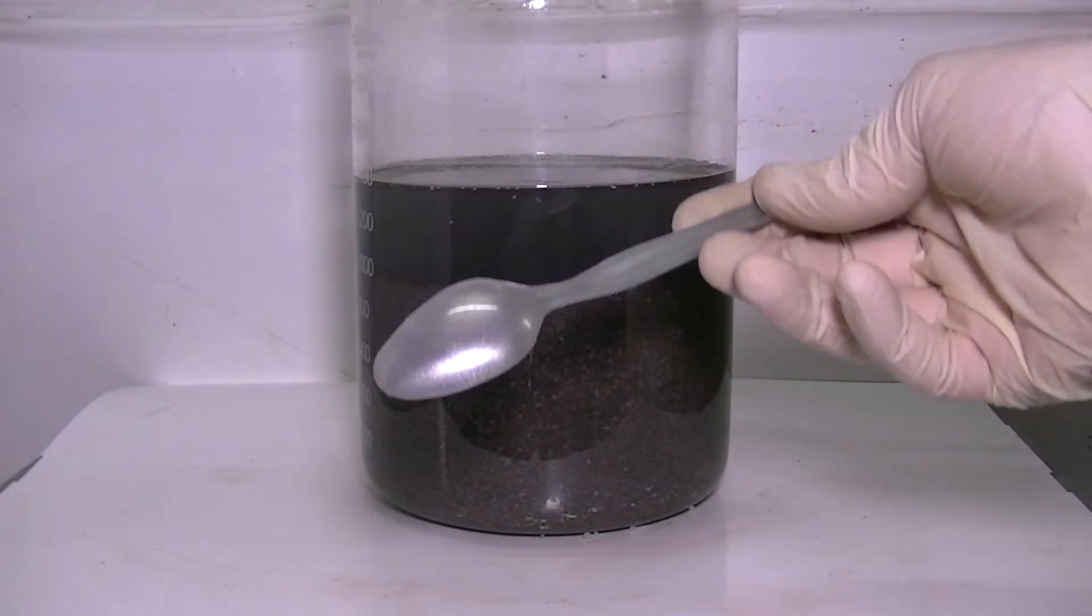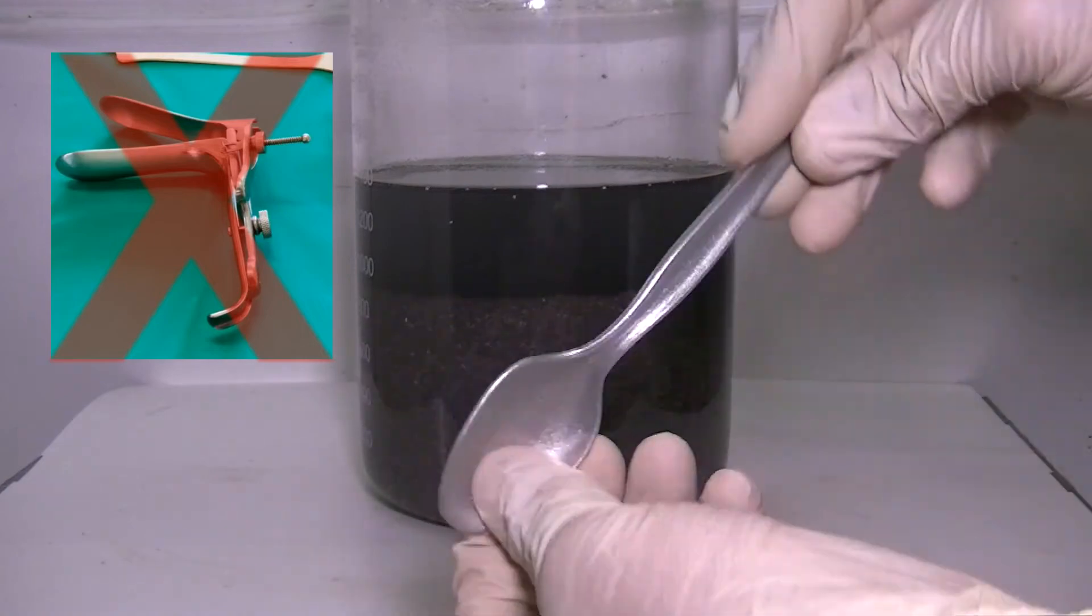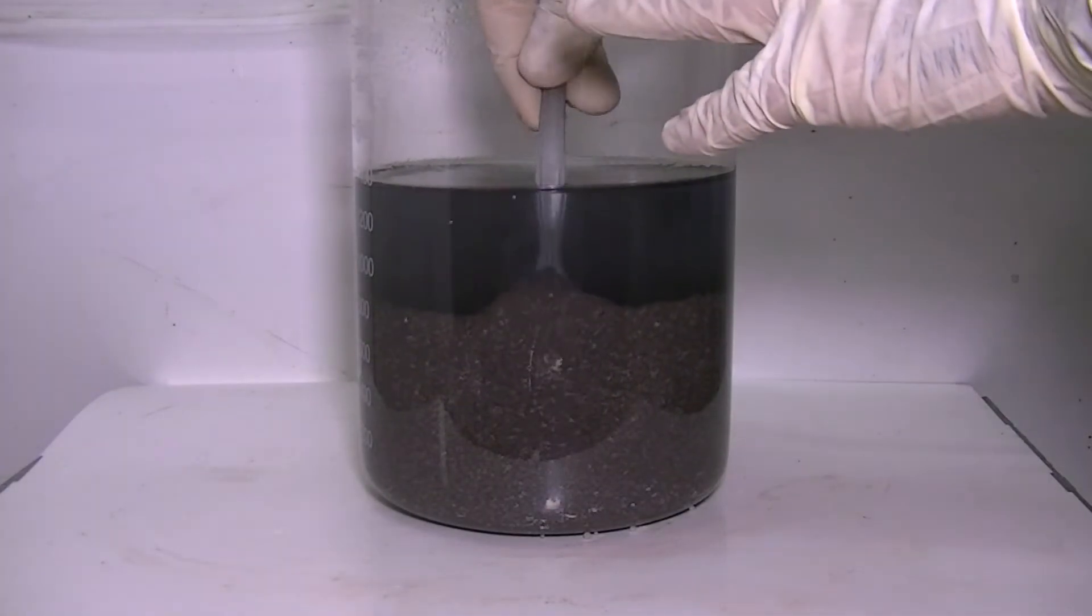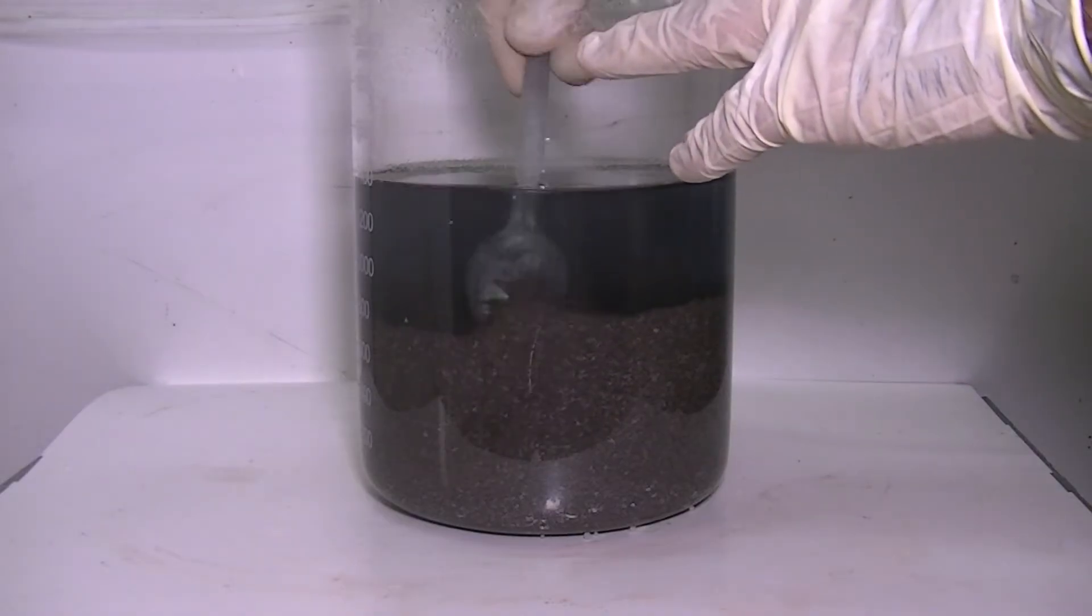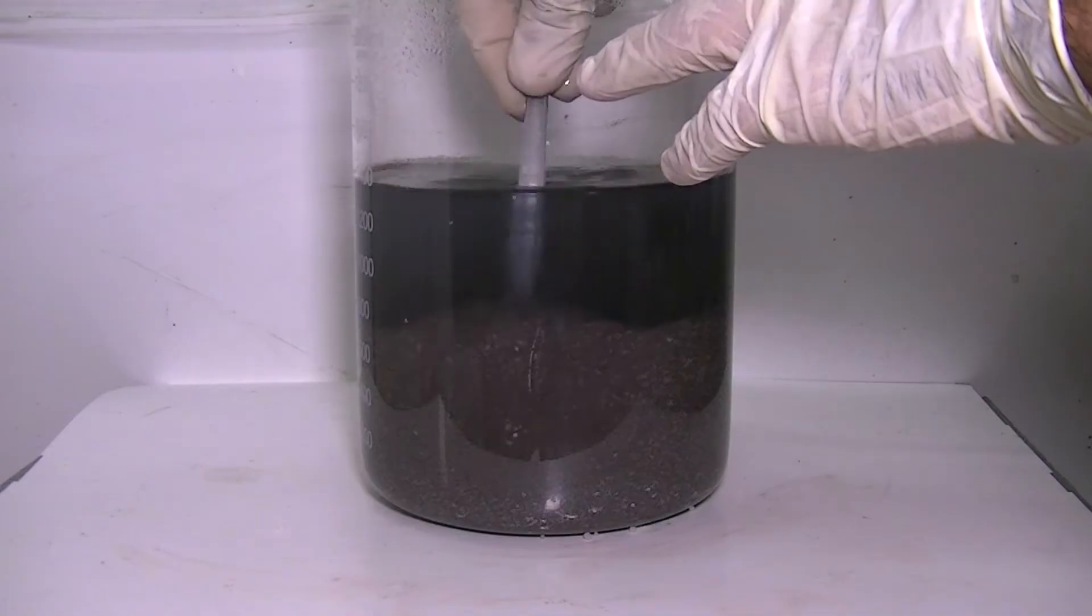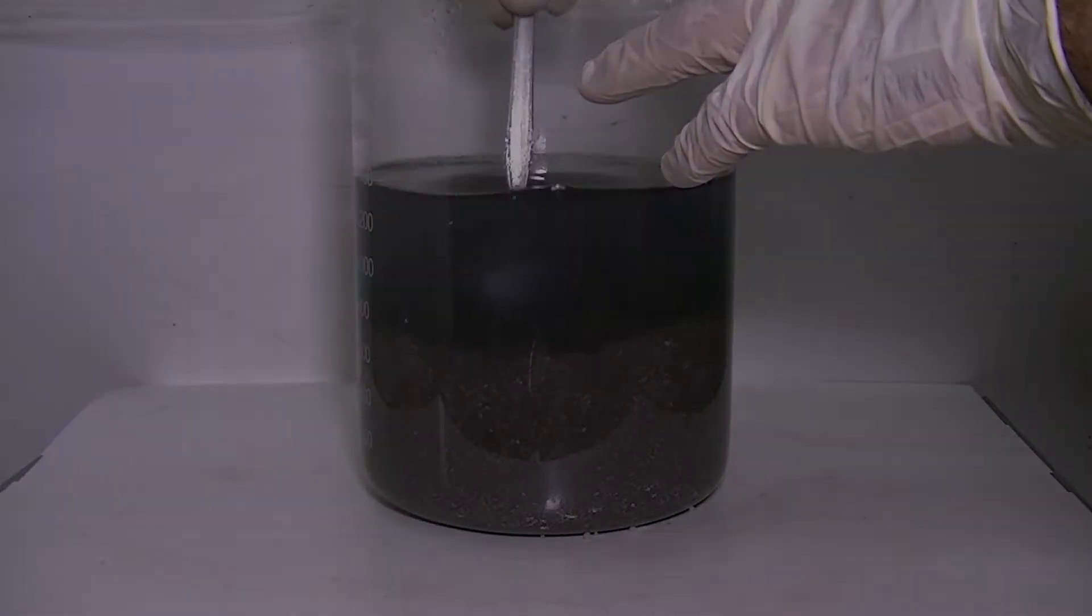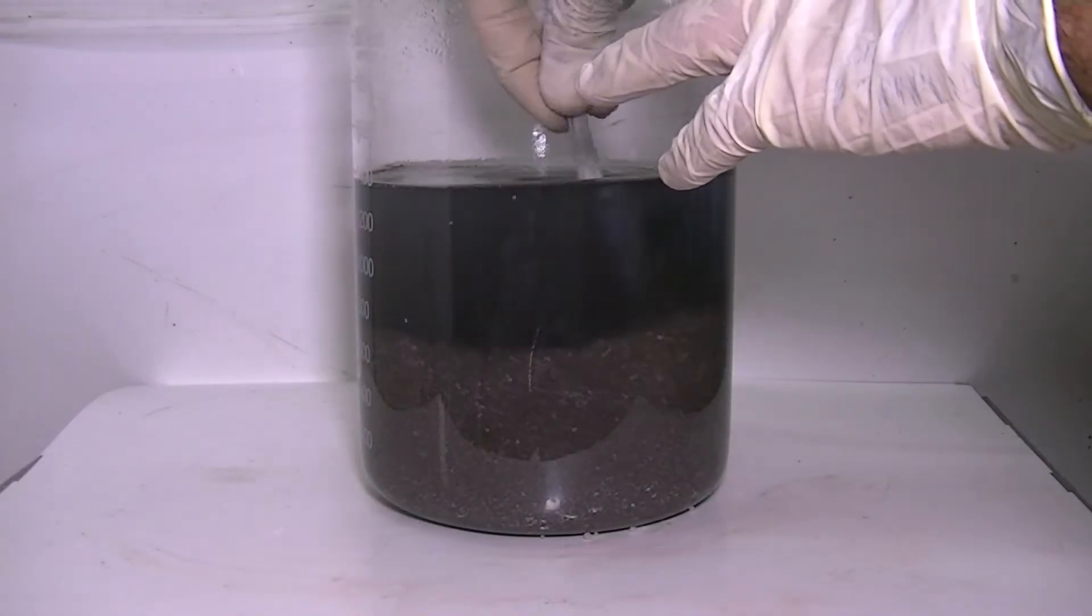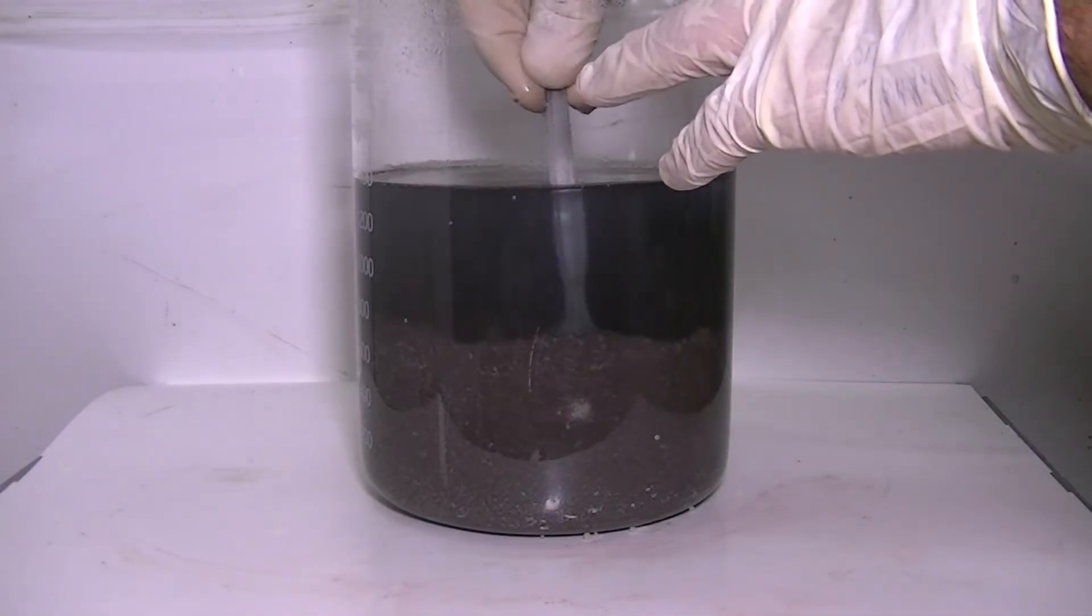Here I'm doing a smear test. I'm basically using a spoon to smear the silver oxide powder against the wall of the glass. If white streaks appear, it means that the conversion was not complete and more sodium hydroxide and stirring are needed. Here's a failed smear test. All right, it seems like the test is successful and there's no more silver chloride.